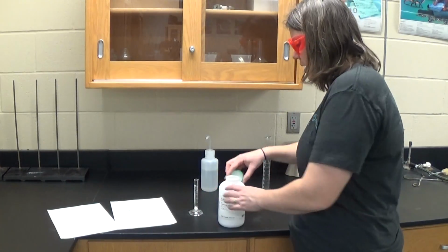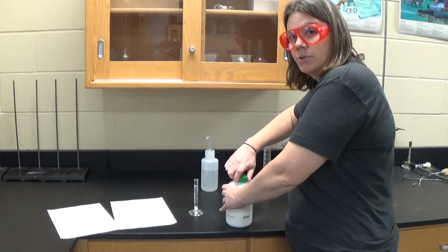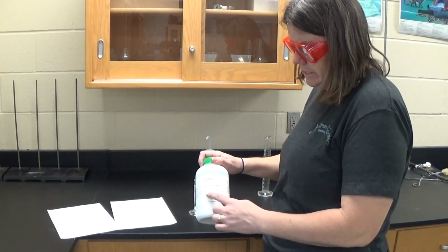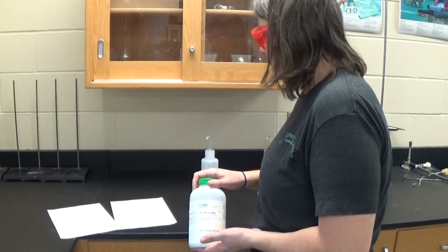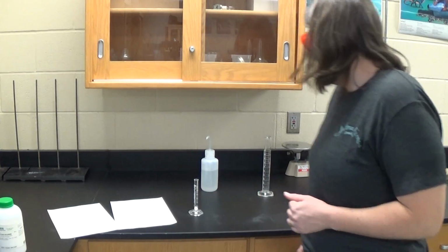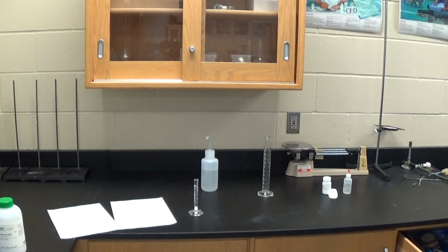I'm going to go ahead and place that spoon over there so I don't use it again. Follow good lab procedure, put the lid back on my container. And as you can see, that does say calcium chloride there. Now the next thing it does is it tells me to add my distilled water and to stir with the stirring rod. I forgot to grab my stirring rod, just give me 1 second.